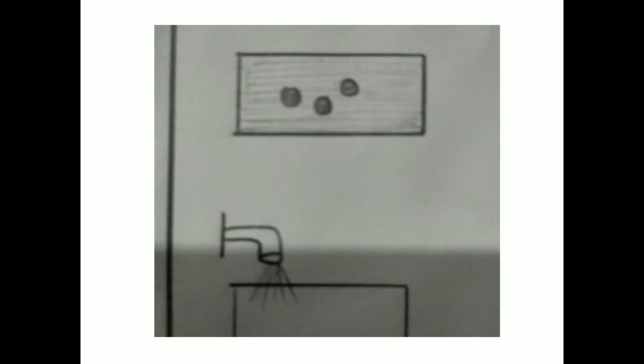So the staining process is completed by adding two or three drops of methylene blue or simple stain, and after that we wait one or two minutes for the reaction. That means the smear and the stain, methylene blue, react with each other.